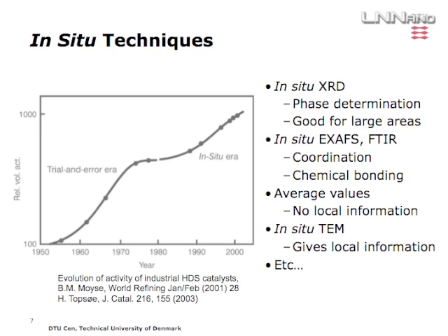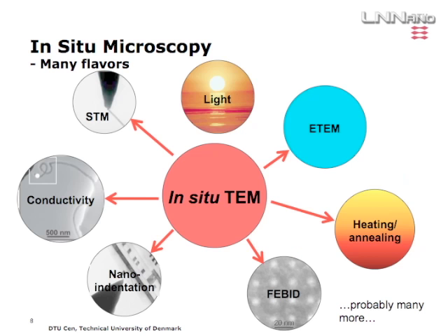Now that's what you get from in situ TEM. You can probe a single nanoparticle as it's exposed to certain environments. And I just put etc. here because I didn't want to insult anybody for doing techniques that I hadn't put up here.